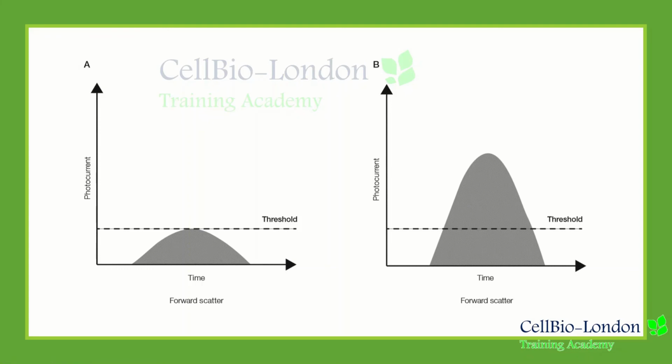Data is collected in a linear scale, but usually displayed as log scale for fluorescence studies, because it expands the weak signals and compresses strong signals, resulting in a distribution that is easy to display on a histogram. Linear display is required when very small differences in fluorescence signals must be assessed, for example in DNA analysis, where there may be a two-fold increase in fluorescence.